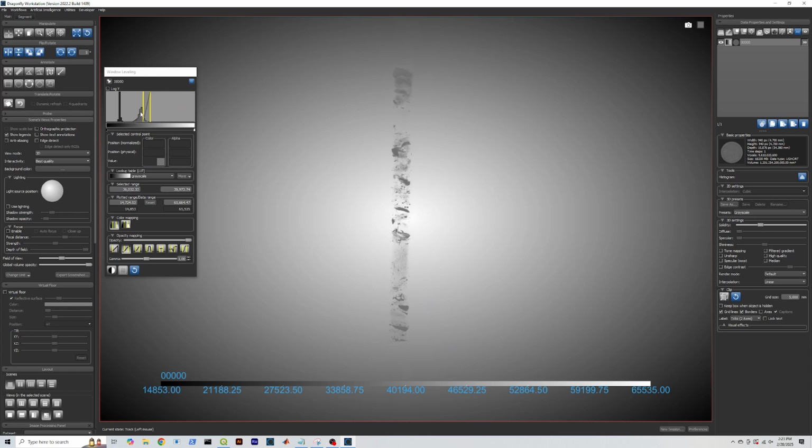When you are working with your jumbo piston cores, I believe the plastic that you use is low enough density that it's often lower density than the mud itself, which means that you can effectively make that portion of the core transparent just using the window leveling tool. If you're using PVC, however, the PVC itself is going to be a higher density than the mud. So you can't remove the PVC using just the window leveling tool. You actually have to clip it out of the frame. And you can do that in the following way.